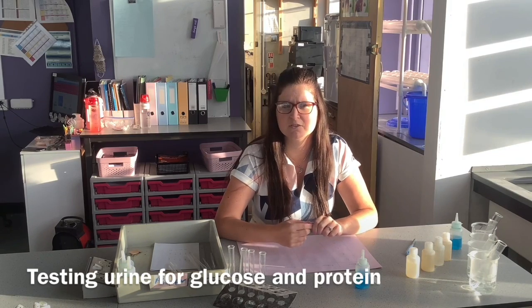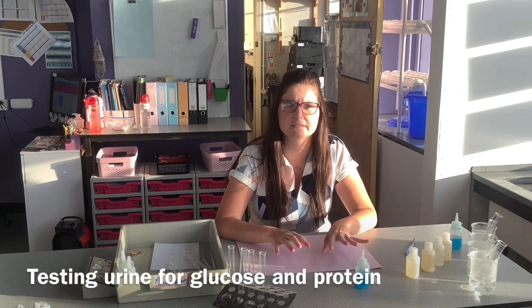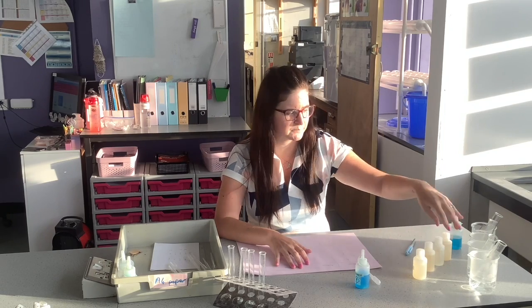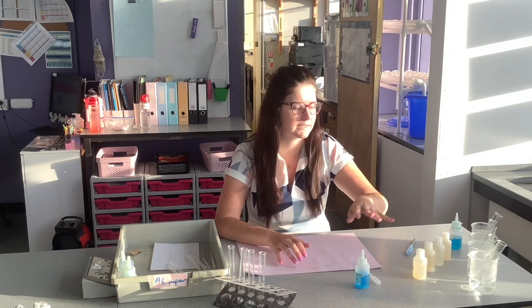Okay, so in this investigation we are looking at testing glucose and protein in urine. This is the part of the spec where we're looking at diabetes and how to test for diabetes. The first thing: I've got my 4 urine samples, labelled A, B, C and D. They will be from 4 people, so person A, B, C and D.